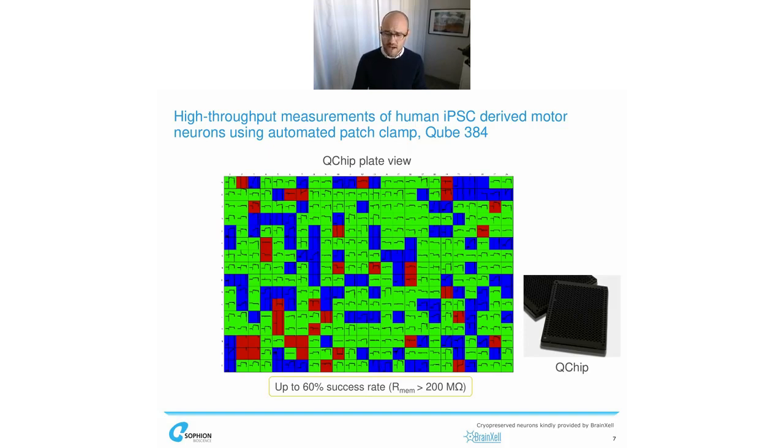And this is a very satisfying, a very good result, I would say, since really, working with a recombinant cell, which many people still use our technology for, or initially most people would really only rely on recombinant cells. It's easy to get success rates in the 80s, 90s, in some cases even 100%. But the 60%, I would really look at it in that way, that 60% out of 384, that's still a tremendous amount of data that is being produced.